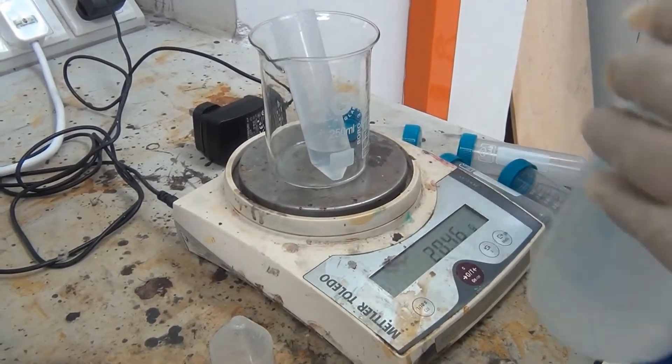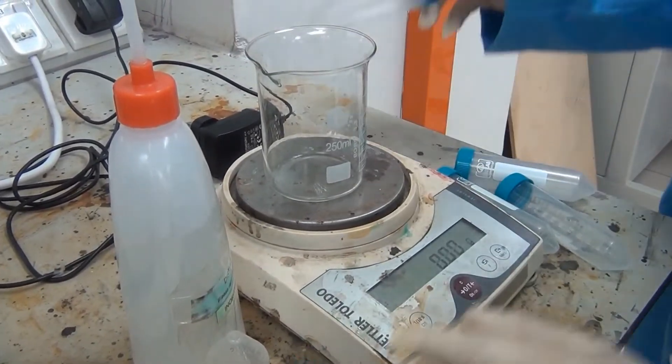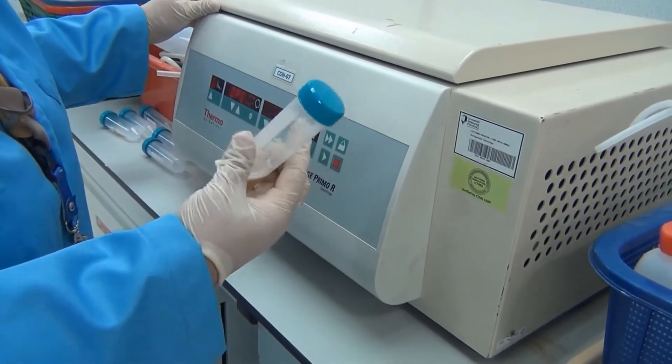Around 20. We do the same for all centrifuge tubes. This is the centrifuge — we want to centrifuge.